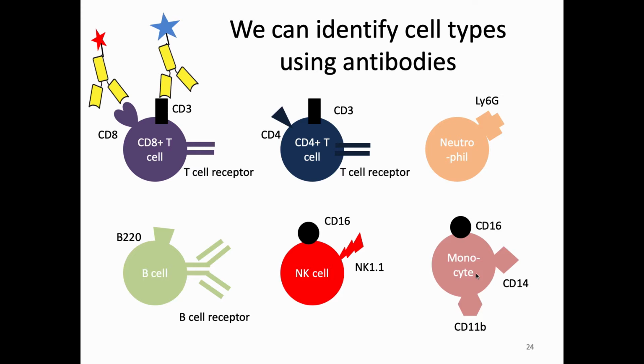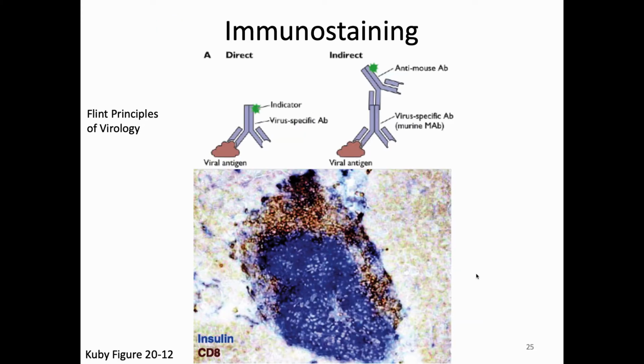So I've told you that we're going to use antibodies in order to detect our cells. But I haven't told you what we're going to do to detect the antibodies, how we're going to find them. You could, if you wanted to, do immunostaining or lots of the other techniques that I already told you about. But let's imagine you did immunostaining and looked at your microscope. And let's imagine that you had to examine 100,000 cells in the microscope. How would you like to examine 100,000 cells in the microscope?